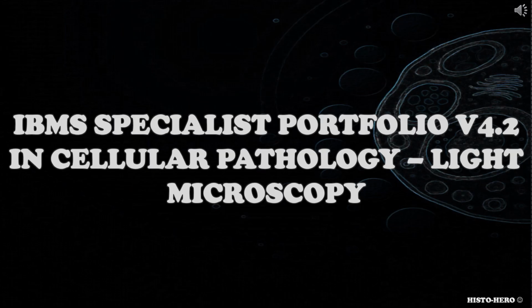And today's video will be about light microscopy, which is part of the IBMS Specialist Portfolio in Cellular Pathology.